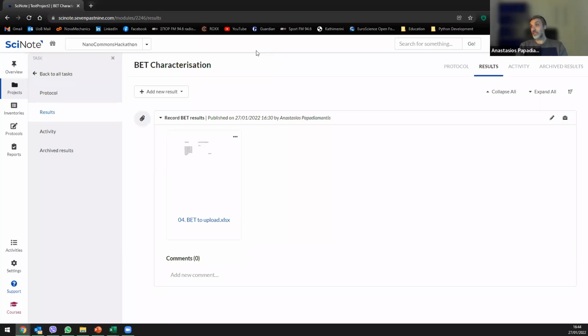Of course, be careful that the more things you upload, the slower the process will be, as you saw when you were importing the inventory, it told you to keep it up to 500 entries because of how fast things can be processed. So the same process applies.